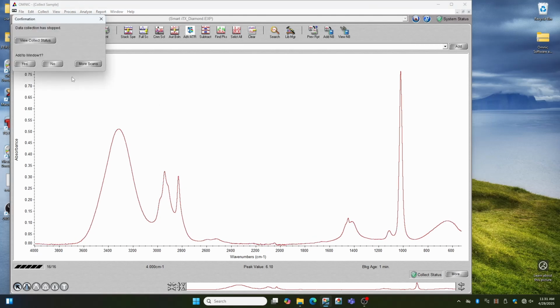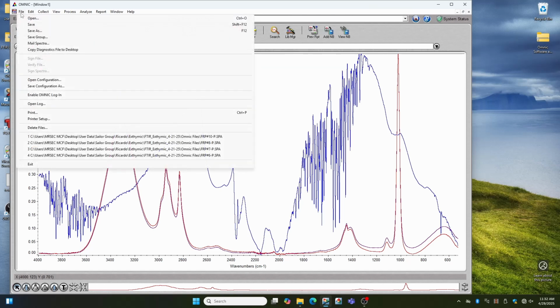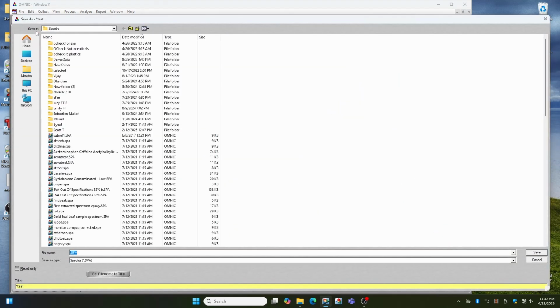Okay, and then once you have this ran, you'll also click add to window 1, so click yes, and then you'll have those spectra. So once you have these measurements, one thing that people often do is they do the auto baseline correction, so you can go ahead and apply that. There's other corrections you can add. So yeah, once you've done that, there's other things you can do, but we won't show you that right now in this Quickstart.